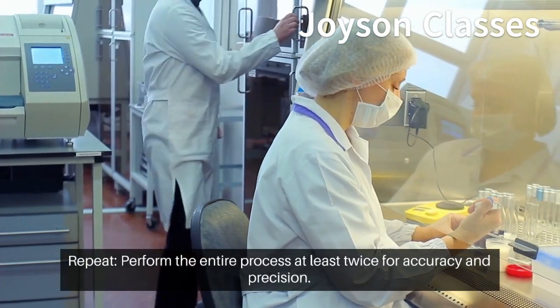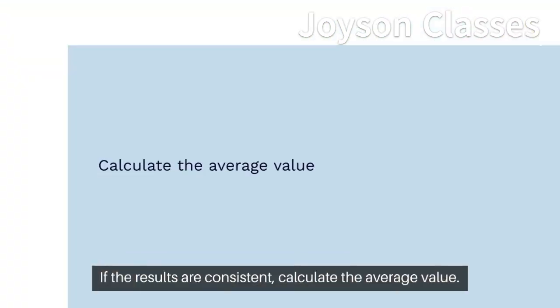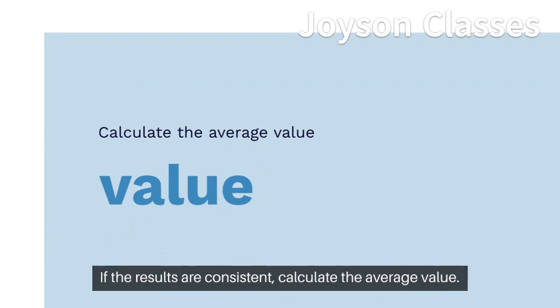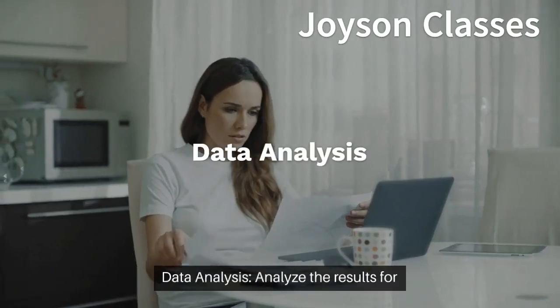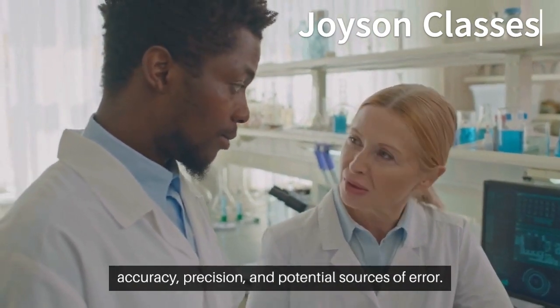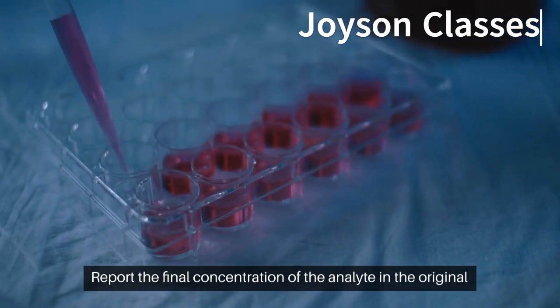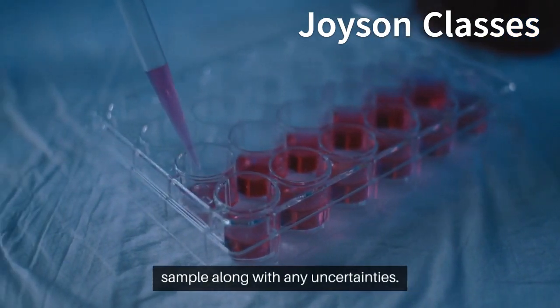Repeat. Perform the entire process at least twice for accuracy and precision. If the results are consistent, calculate the average value. Data analysis. Analyze the results for accuracy, precision, and potential sources of error. Report the final concentration of the analyte in the original sample along with any uncertainties.